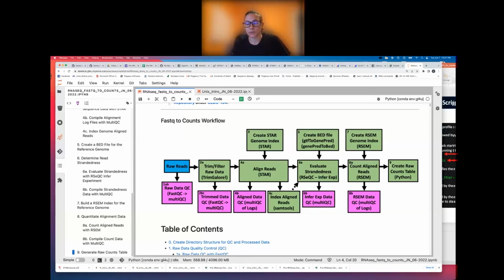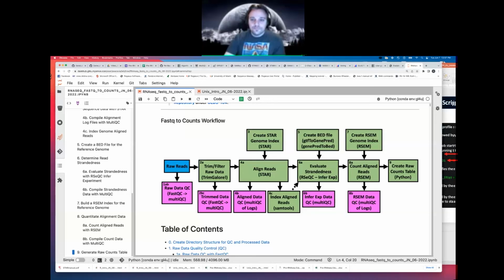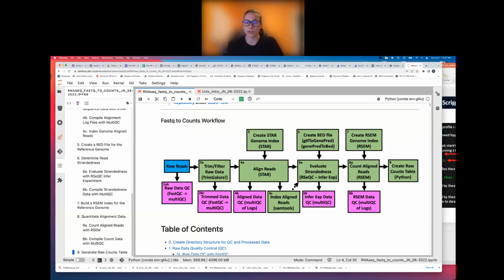That's one of the reasons that we established our AWGs, because there are a million different ways to do each step of this pipeline, a bunch of different tools that can be used. And we don't trust that we're going to be comprehensive experts on every possible tool out there. So the more people we get involved, the more input we get, the more confident we can be that when building a consensus pipeline, it's the best option for our data at the time in which it's implemented, according to as many scientists as we can have their input in.